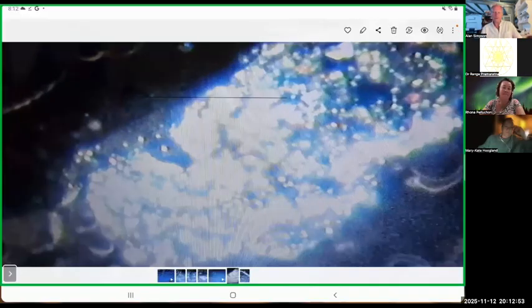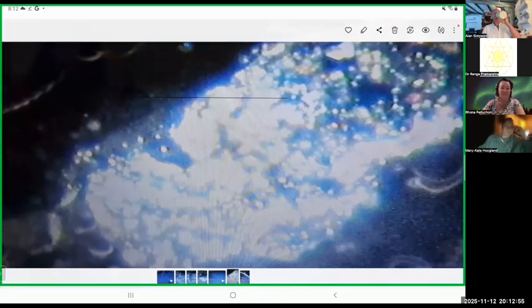Okay. Yep. We see you. So can you see this image? That's a massive protein in the blood. All these bright spots and the reddish spots are uric acid. Uric acid is the first defense when heavy metals come into the blood or any oxidizing chemical. Uric acid will bind it and store it in the body. So when it binds, stores, and releases back into the blood, the acidity goes up.